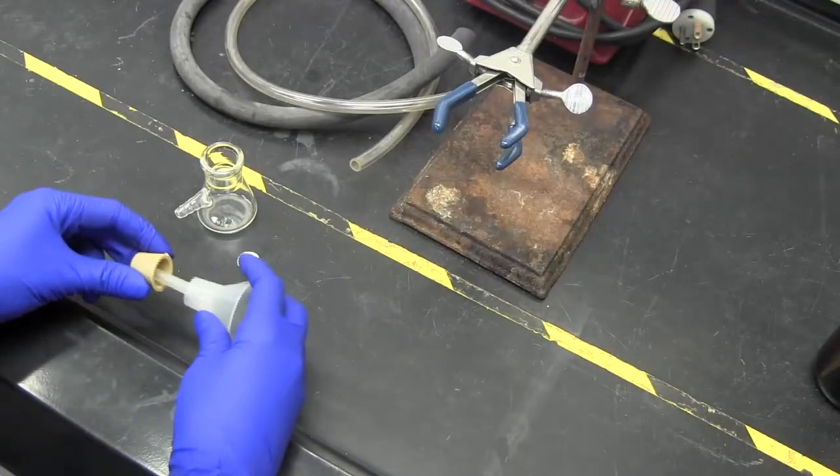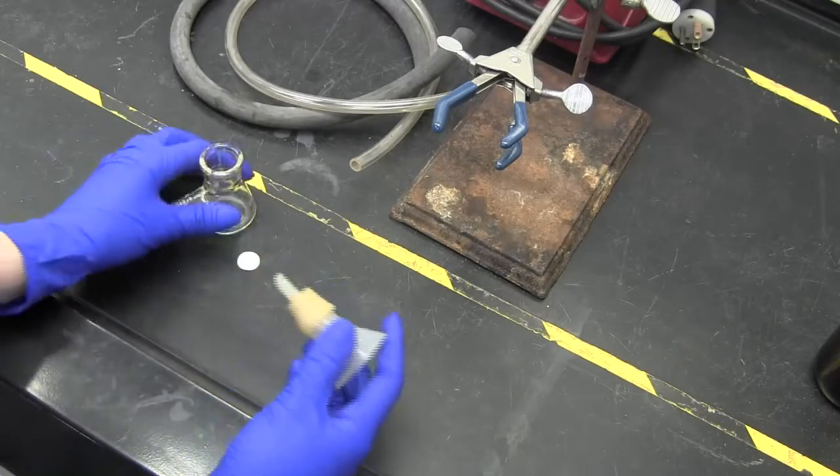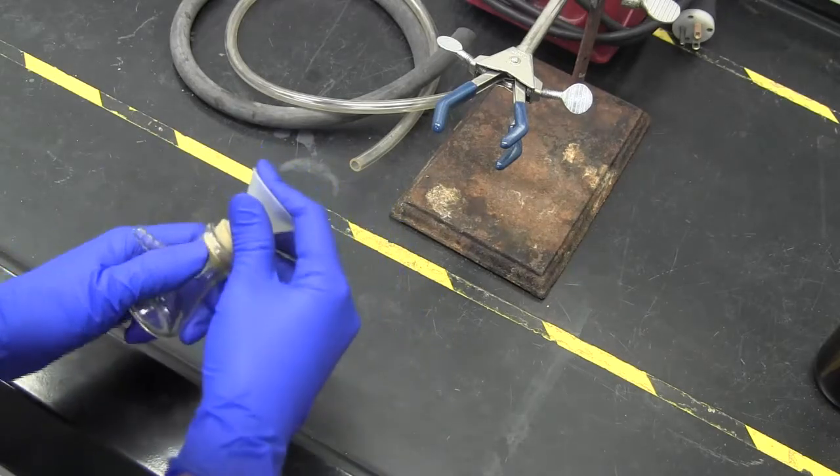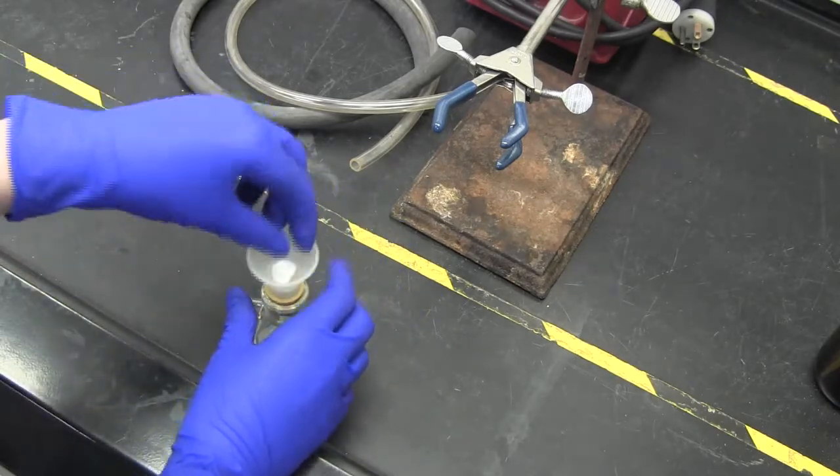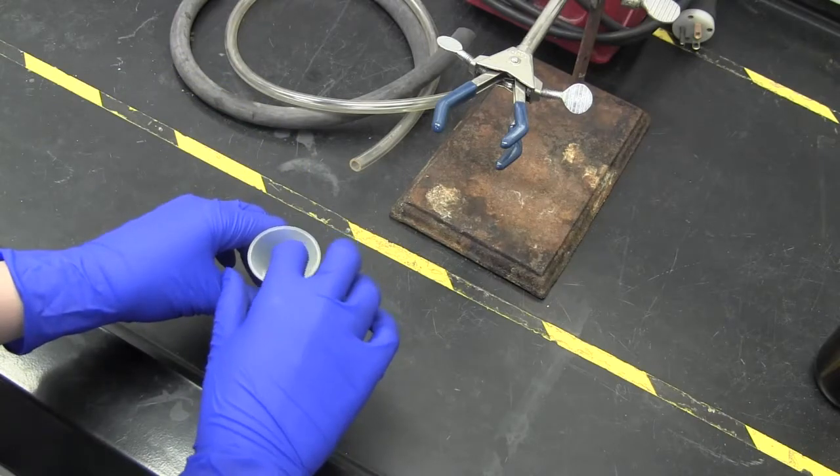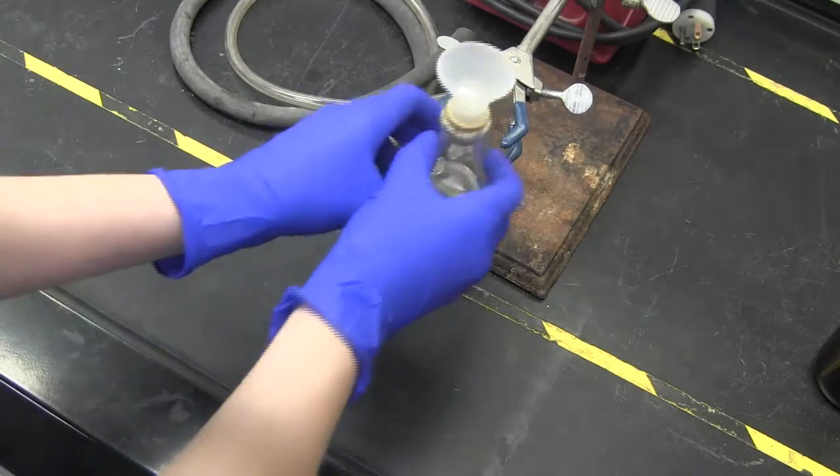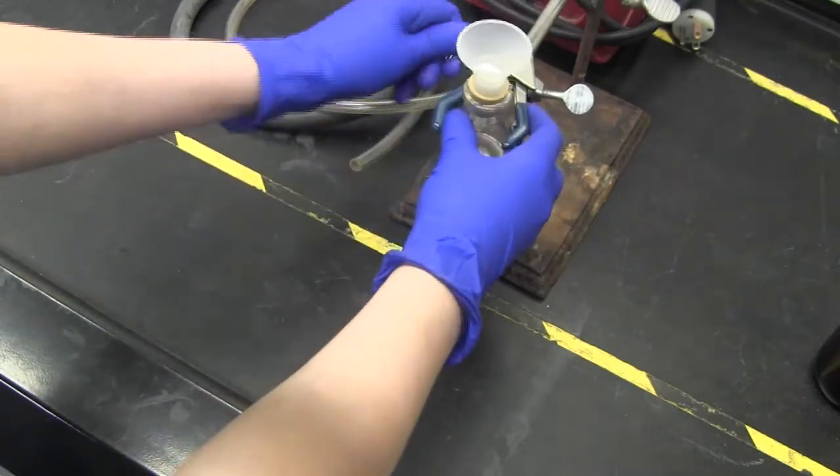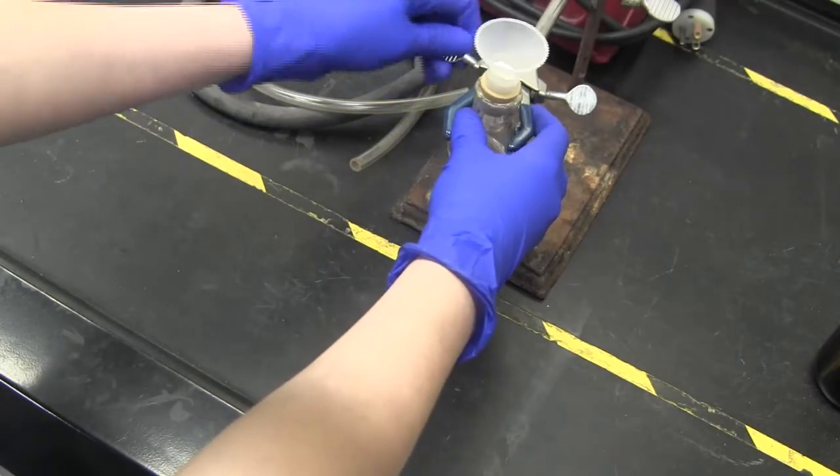Begin by fitting the Hirsch funnel into the filtration flask. The rubber connector will help them stay together snugly. Place the filter paper on the top of the frit in the funnel and wet the filter paper with the solvent you are using. Then clamp the apparatus into a ring stand so it does not tip over while filtering.